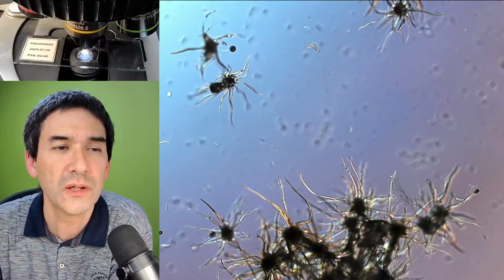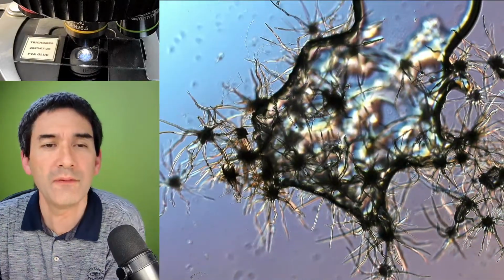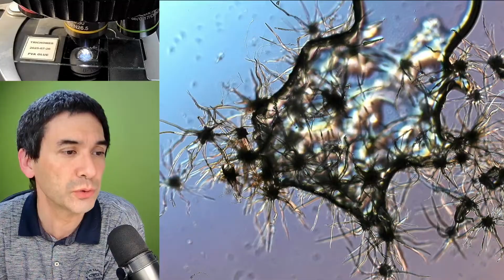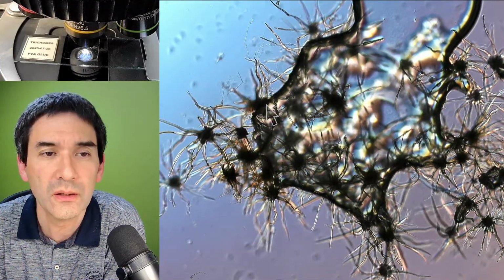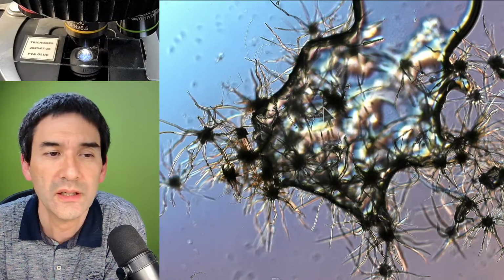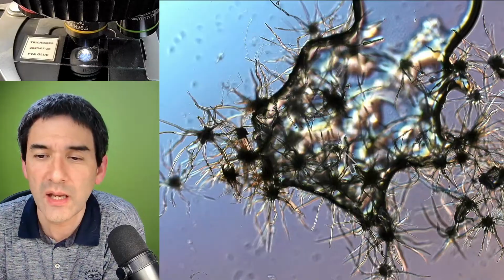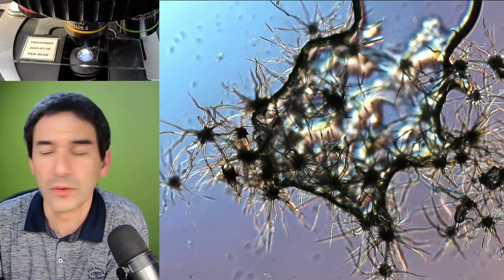That's why it's a good idea to spread them apart. And what we have here is one of those, under quotation marks, problems, and that is if they're too much clustered together. You see over here, the dark line, that's of course an air bubble. So the glue does not completely cover them. I think it's okay. But just to turn off the arrow again.